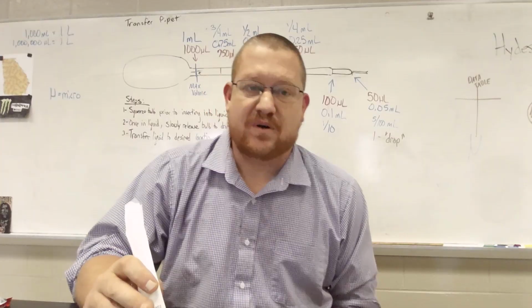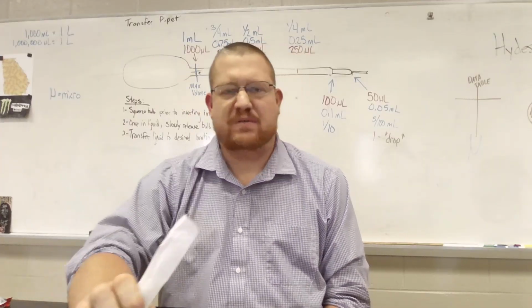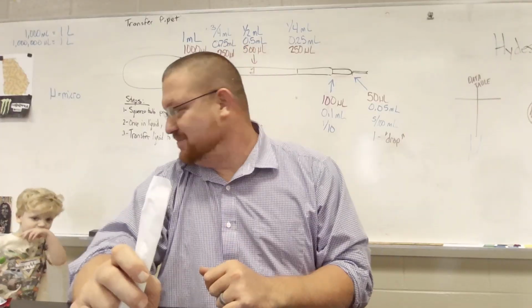In this series, we will start with some very basic lab tools and skills and work our way up as we work throughout the year and add and build onto our skills.